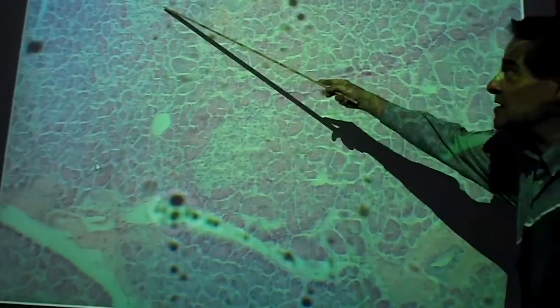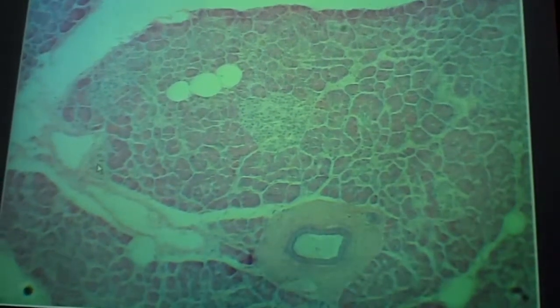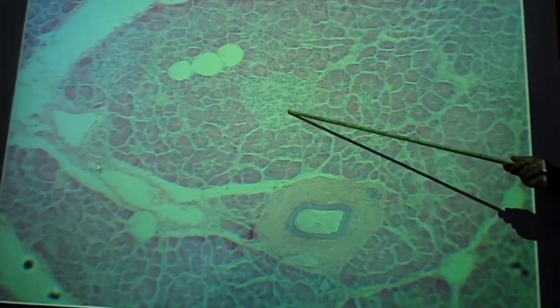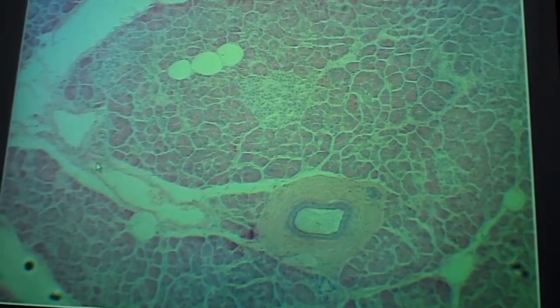Here again, this is the extra tissue, the lighter stain, islands of tissue, endocrine. And these are called pancreatic islets or islets of Langerhans. Islets of Langerhans or pancreatic islets. Right, here's a nice pancreatic duct, as you can see. Right here. That's an islet of Langerhans. They produce the hormones insulin and glucagon, and here are the cells that produce the enzymes, exocrine cells. They're pretty easy to distinguish.